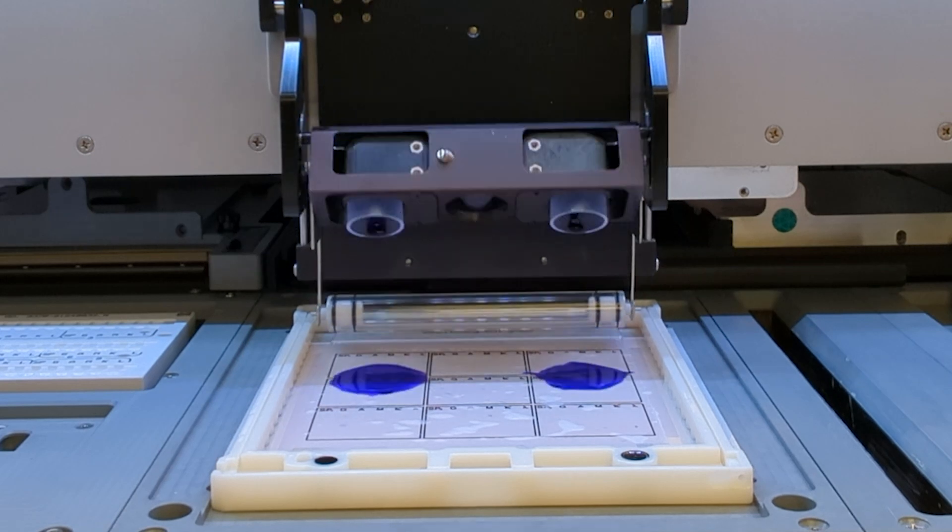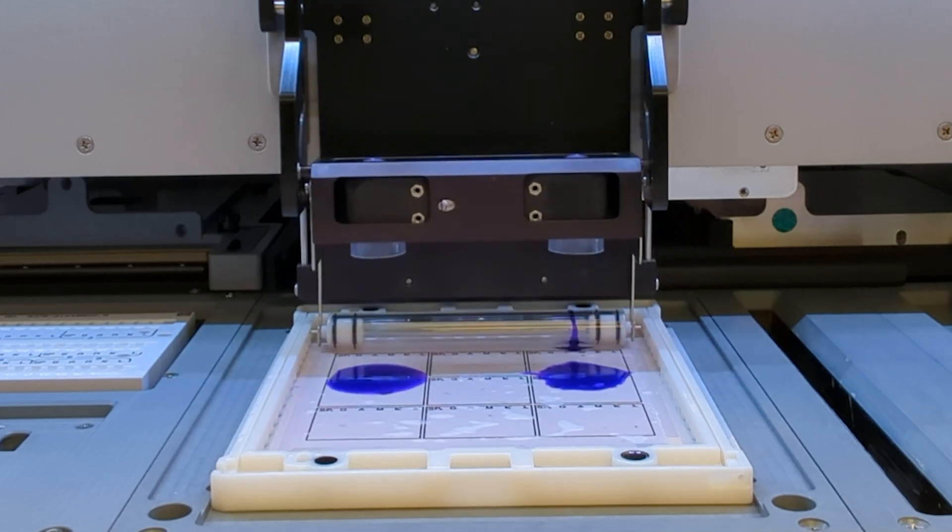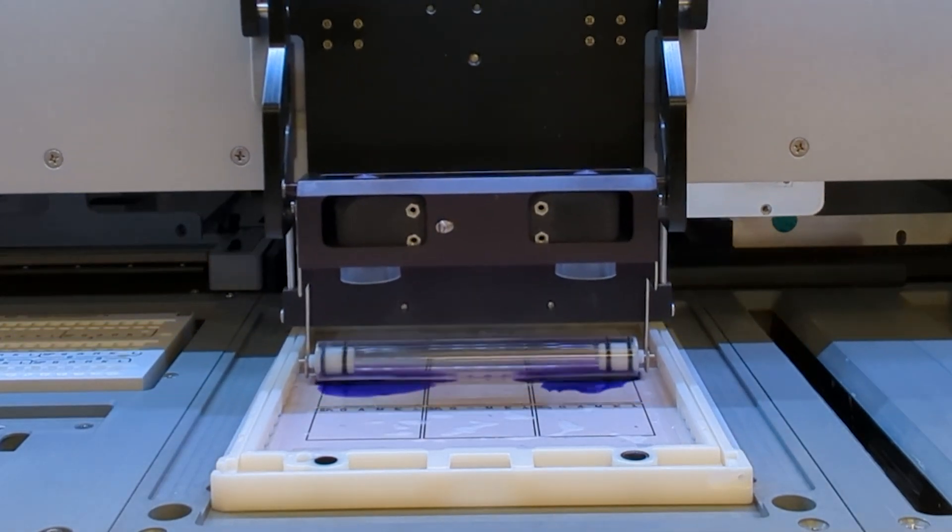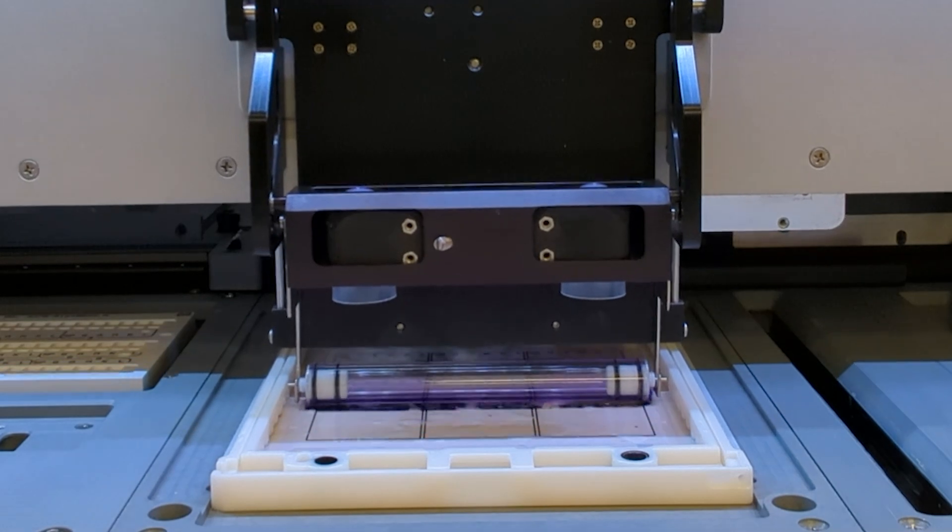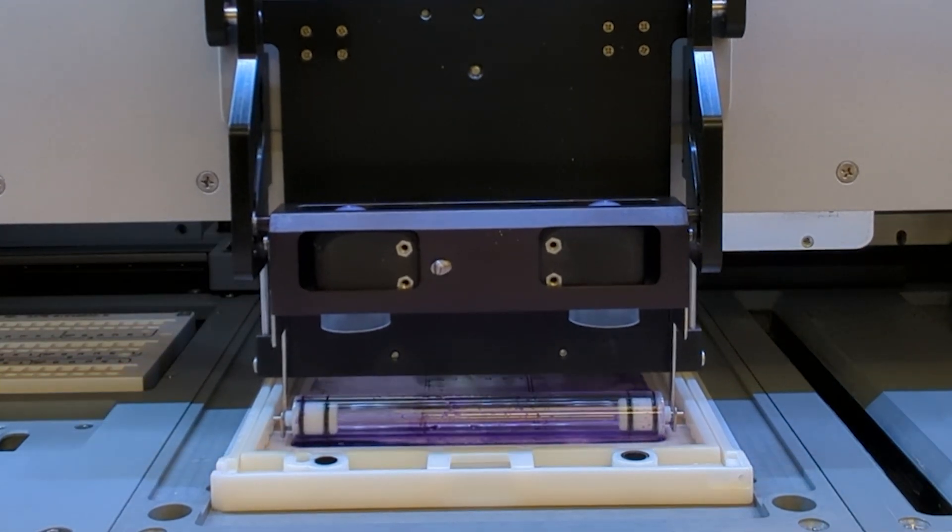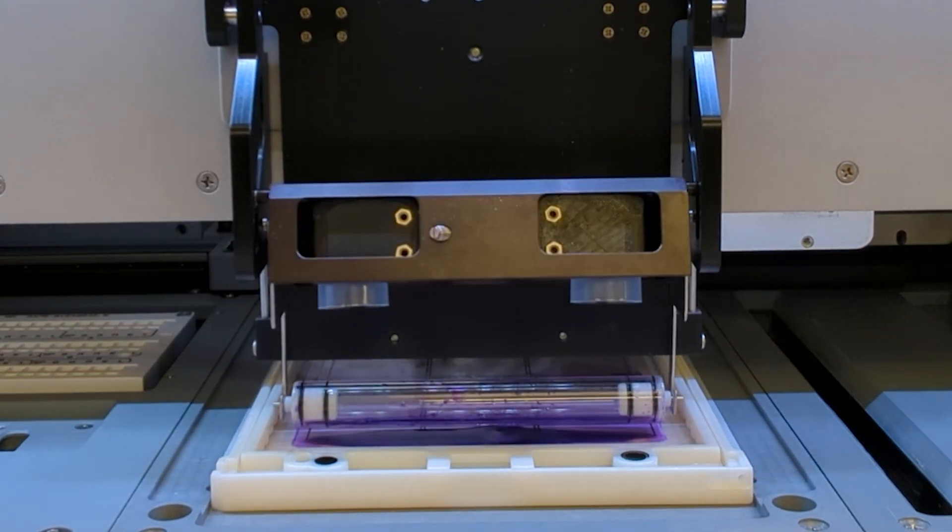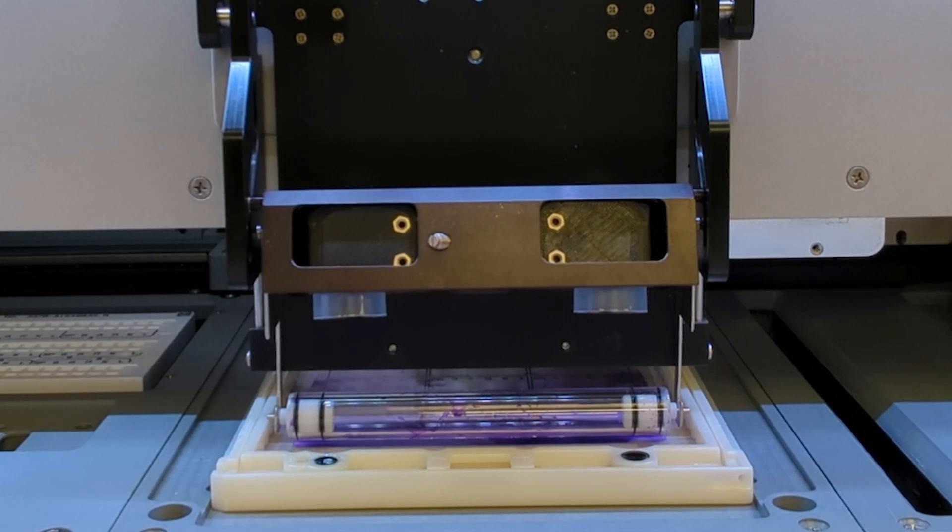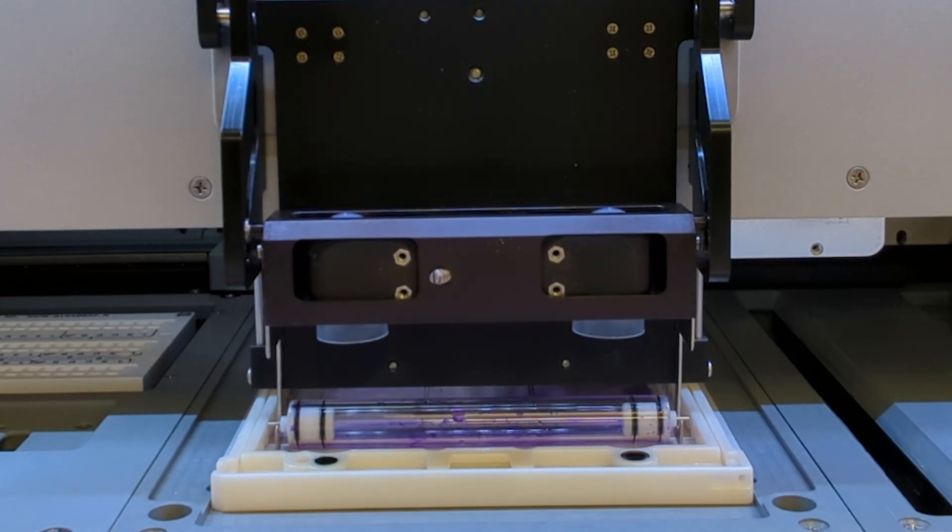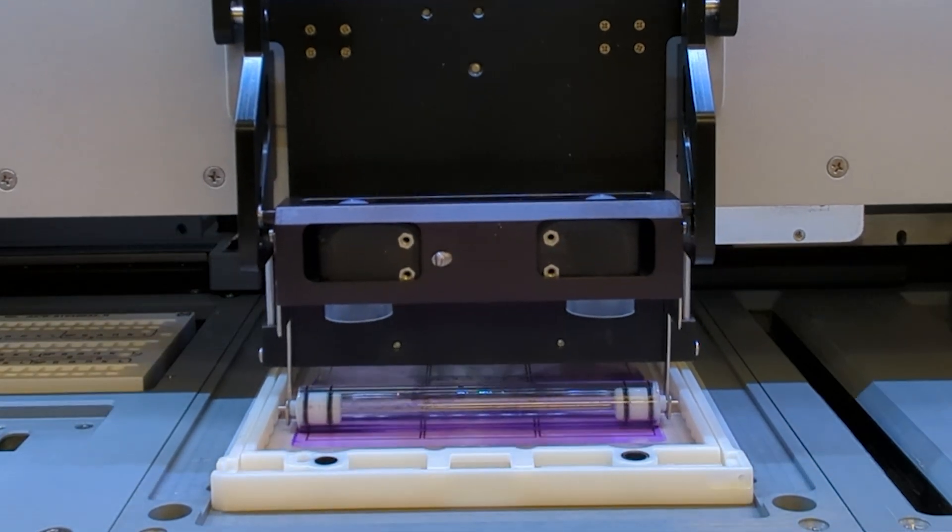To reduce waste and add efficiency, a unique reagent application system uses microvolumes of ready-to-use direct stains. Gels can be developed enzymatically or automatically stained, de-stained, dried, and scanned.